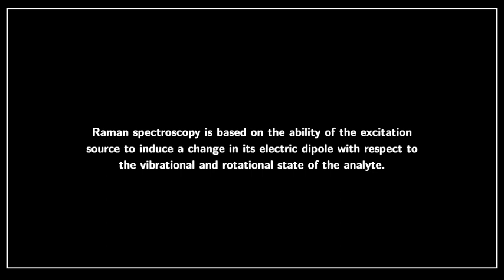It is not the fact that there is an electric dipole. There is another technique called infrared spectroscopy, which I'm not covering here, where infrared spectroscopy interrogates the presence of a dipole. Raman spectroscopy interrogates the change in an electric dipole. And if you remember, the change comes from the fact that we calculate the first derivative of the dielectric tensor with respect to a normal mode. So it's the derivative. What matters is the change in the electric dipole.